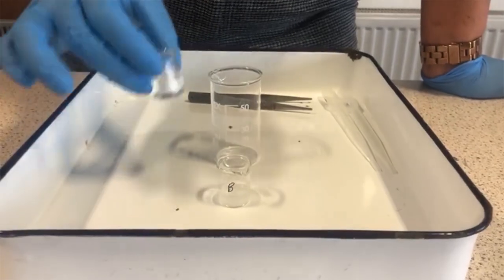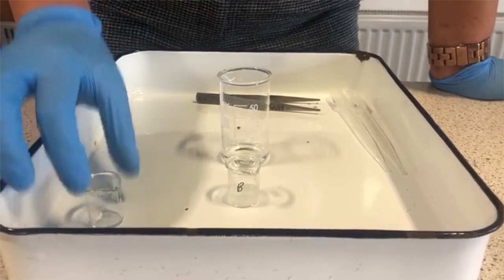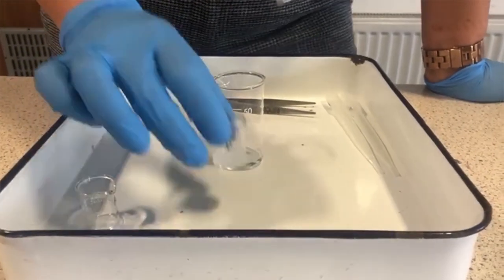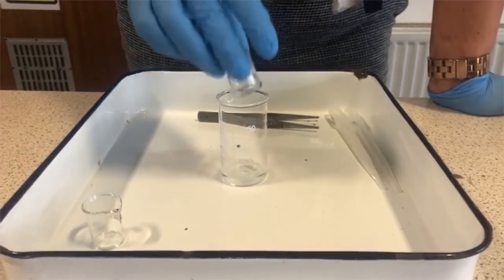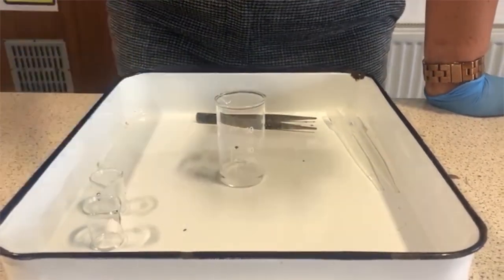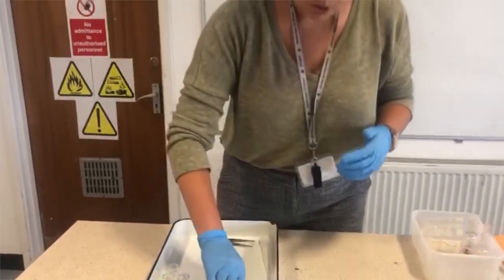So I'm going to put chemical A into my beaker. I'm wearing gloves because these chemicals are quite strong. Chemical B is going in. Hopefully you can all agree with me — what went in were two liquids. But let's have a look at what happened, shall we?